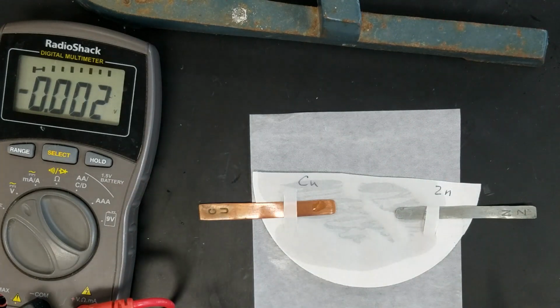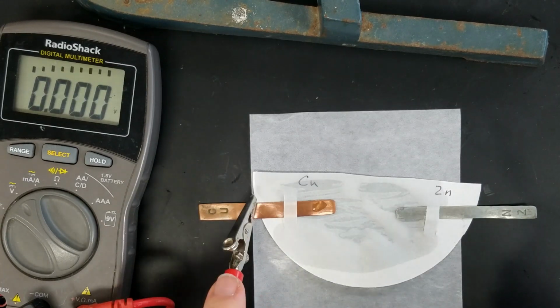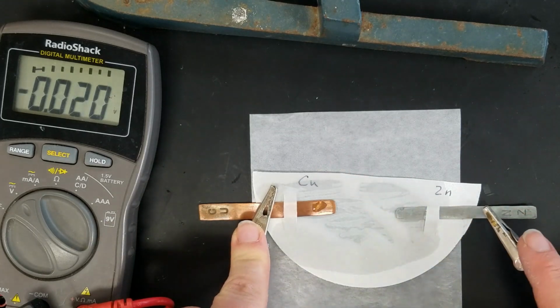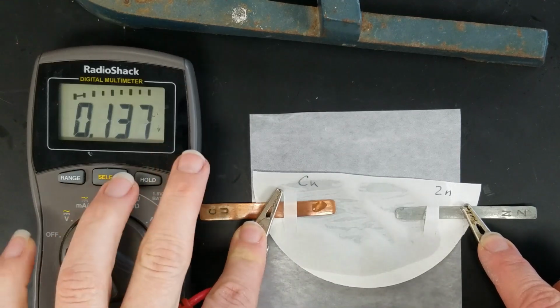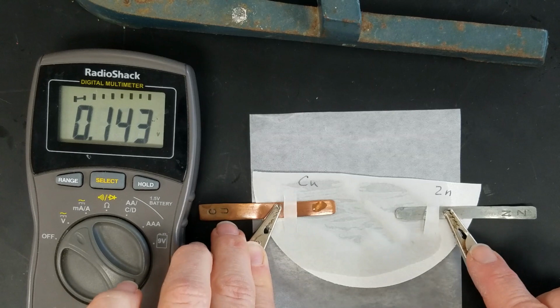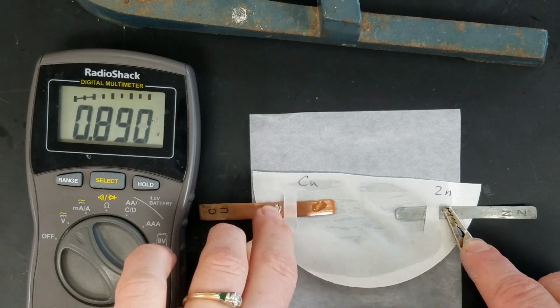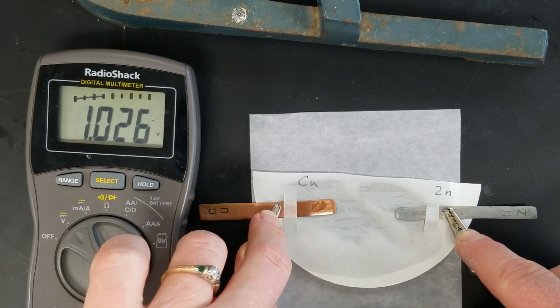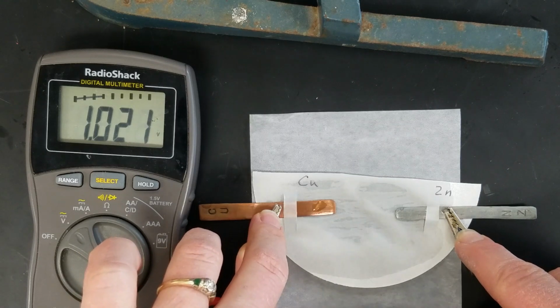Alright, for our galvanic cell, the red lead goes on the cathode and the black lead goes on the anode, and it will give us a positive reading when our anode is using the black lead and our cathode is using the red lead. So you want to record the voltage for this cell.